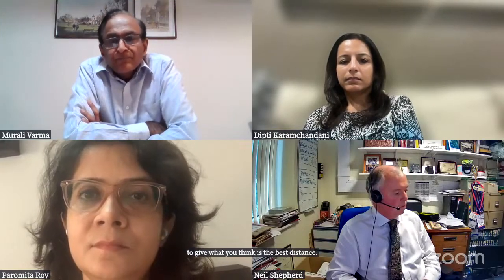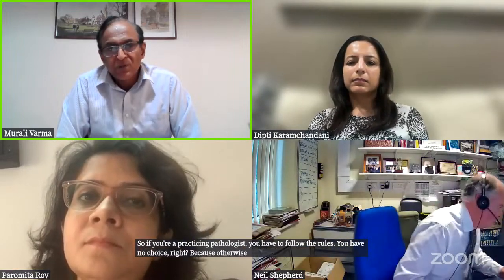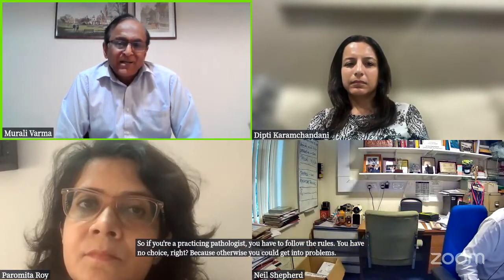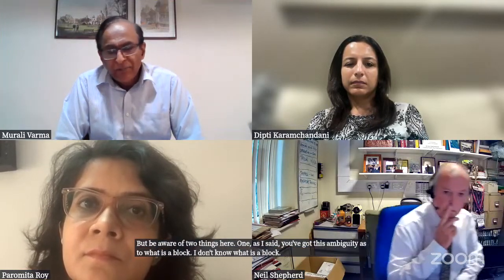Okay, with reference to extensive sampling, how would a minimalist model be created, or is it at a pathologist's discretion as to the minimum number of blocks taken? I think with all of this, there are two things here. One is the guidelines, isn't it? If you're a practicing pathologist, you have to follow the rules. You have no choice, right? Because otherwise you could get into problems. But be aware of two things here. One, as I said, you've got this ambiguity as to what is a block. I don't know what is a block. Sure. I don't think anybody knows what is a block.